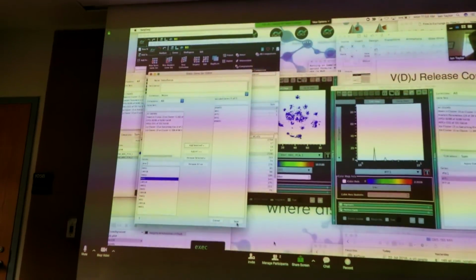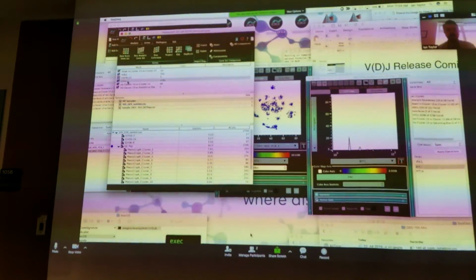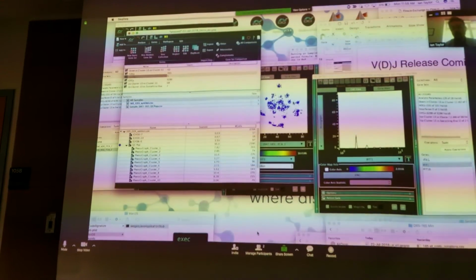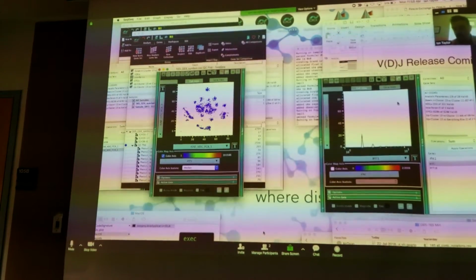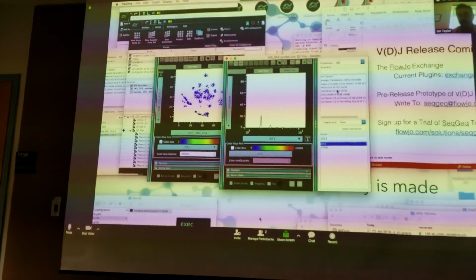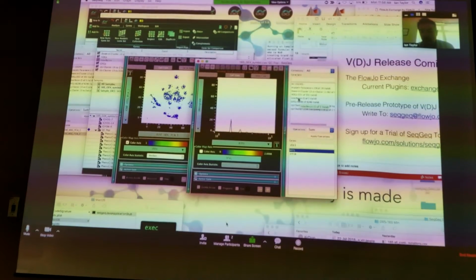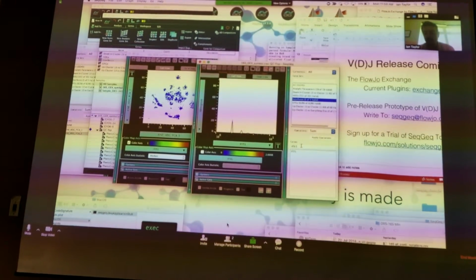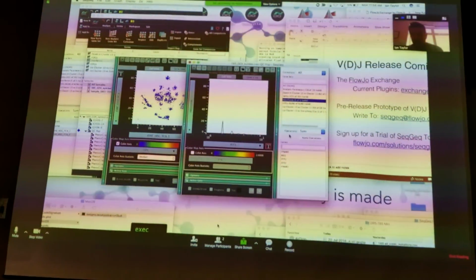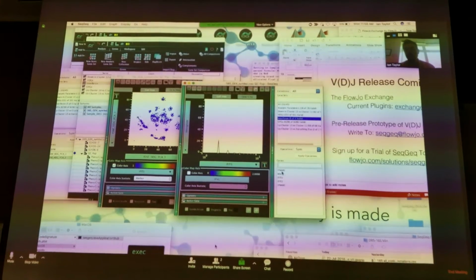There's actually a variety of things we can do with gene sets, including treating each of these sets of genes as its own individual parameter, if that's of interest. The way I would do that is look at a statistic based on those parameters for each cell. So if I select interferon with these 5 genes available in it, if I remove my filter here, we can see all 5 of them. If I click apply, we're going to look at a histogram of the sum of these genes.